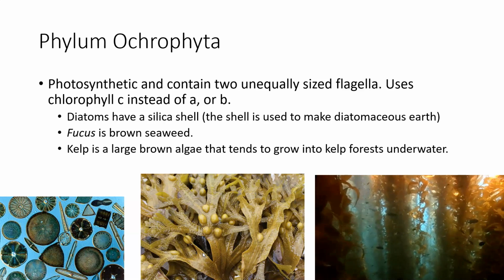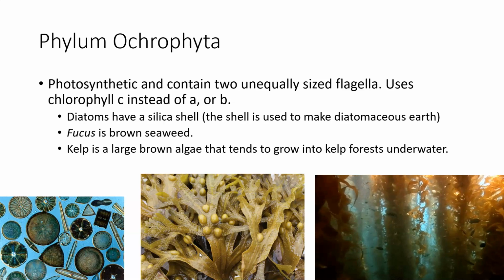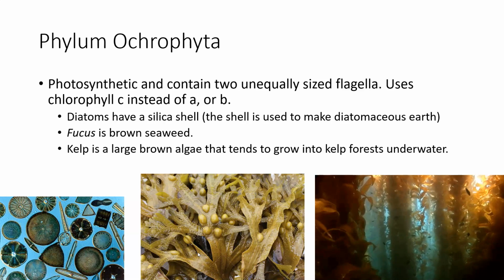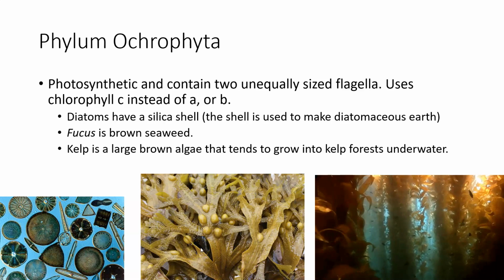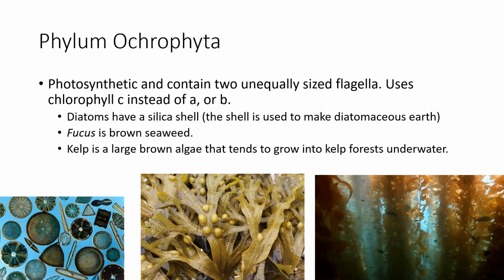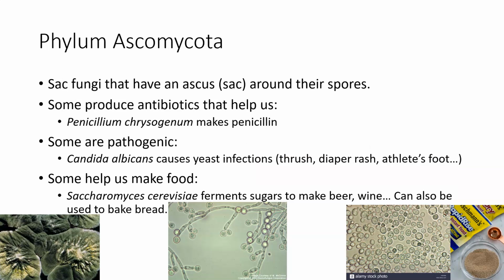They've given you a little picture of diatoms, and then there's some, it looks like kelp that's washed up on a beach someplace where there's a dude standing next to it. So this is the only one they wanted you to draw there. All right. We already did that slide, so we're okay there.